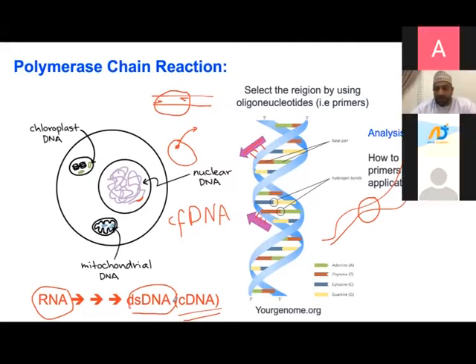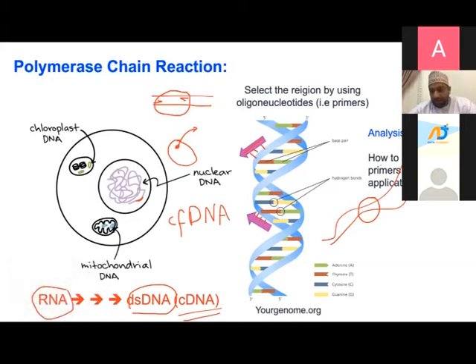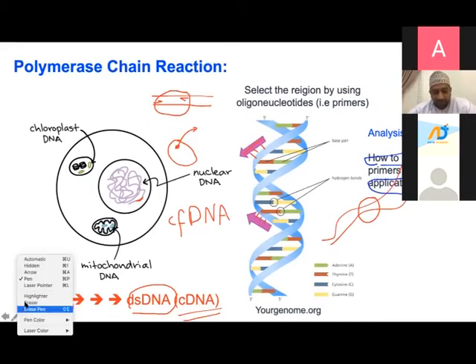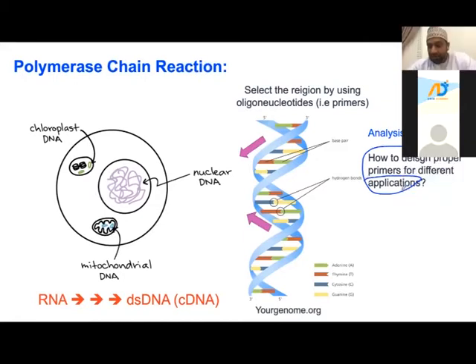So what I'm planning to do in one of the analysis workshops that we're going to cover is to try to show how you design primers. So this is something that you need to know. Primers are easy to make, but you need to know certain rules, so you can get better products. And remember that there are different applications of designing primers, so designing primers can vary between different applications. In this webinar, I'm going to talk about applications and try to cover certain rules. But again, this will be a topic of the coming workshop, inshallah.